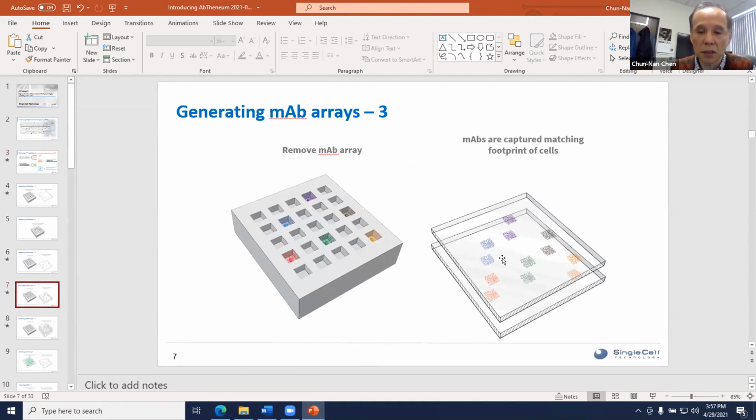If you do the staining on both of them, in fact even on 3 of them, we see completely identical patterns. So this is at least one demonstration of the consistency of the binding assay that we have. And the other side is we also get the sequence, and we are able to match the sequence to all of the binding sites.